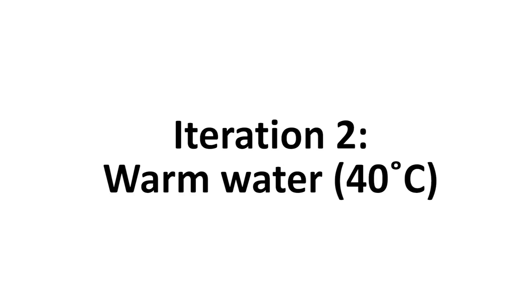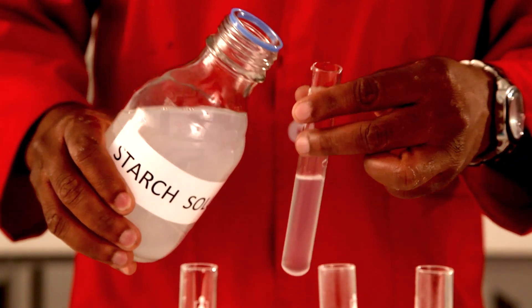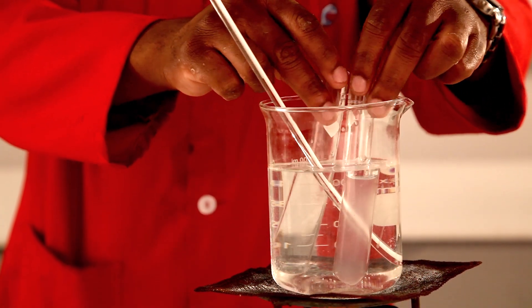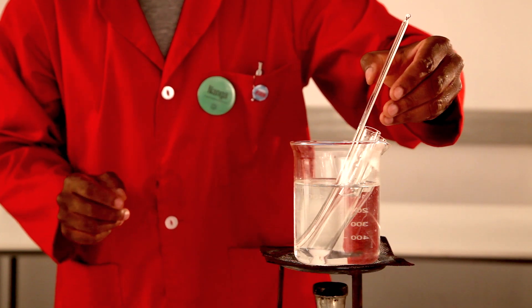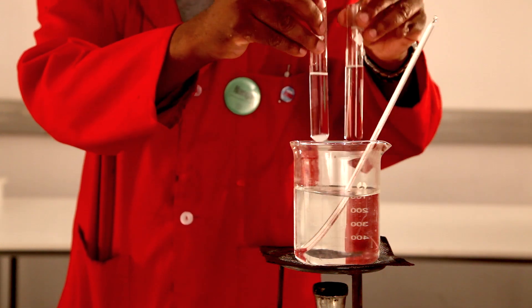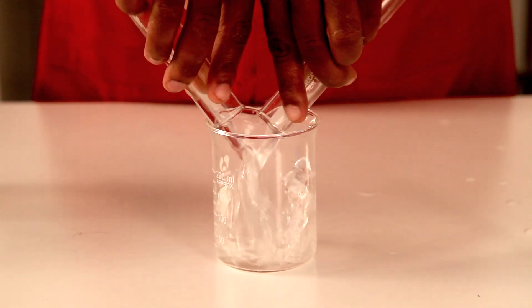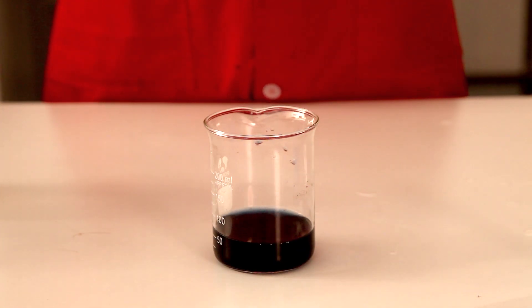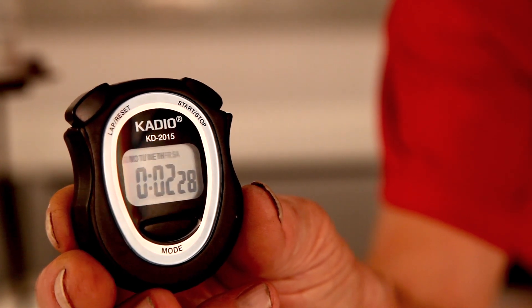Alteration 2: Warm water. Pour 10 cm³ of iodine and starch solution into separate test tubes and place them in a warm water bath at about 30 to 40 degrees Celsius. The temperature must not exceed 40 degrees Celsius. Leave the test tubes for about 5 minutes to acquire the temperature of the water. Then pour the contents of the test tubes into a 250 cm³ beaker. With a stopwatch, read the time elapsed from the moment the solution mixes until the mixture turns deep blue.